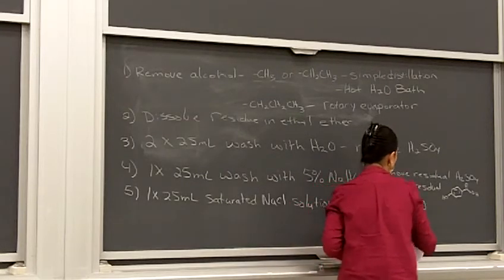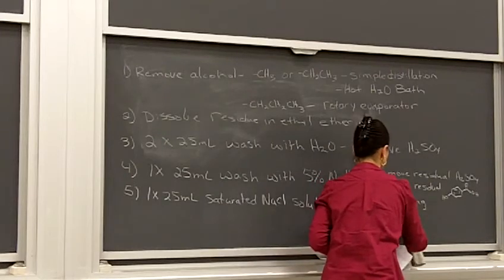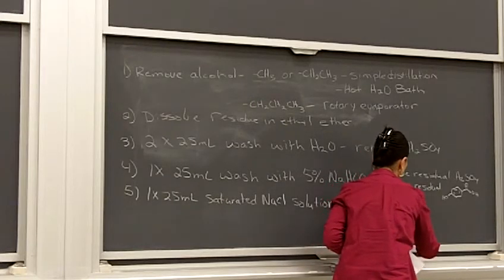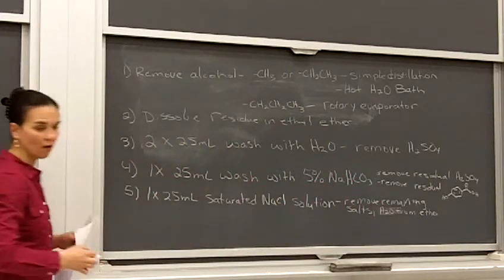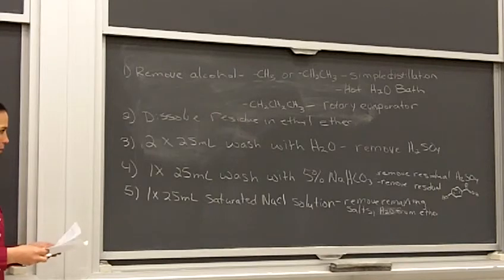Helps drive water more towards the aqueous layer. Okay. It doesn't get rid of all of it, but it does help get rid of a little bit of water, a little bit of get rid of the residual salts and a little bit of the water.